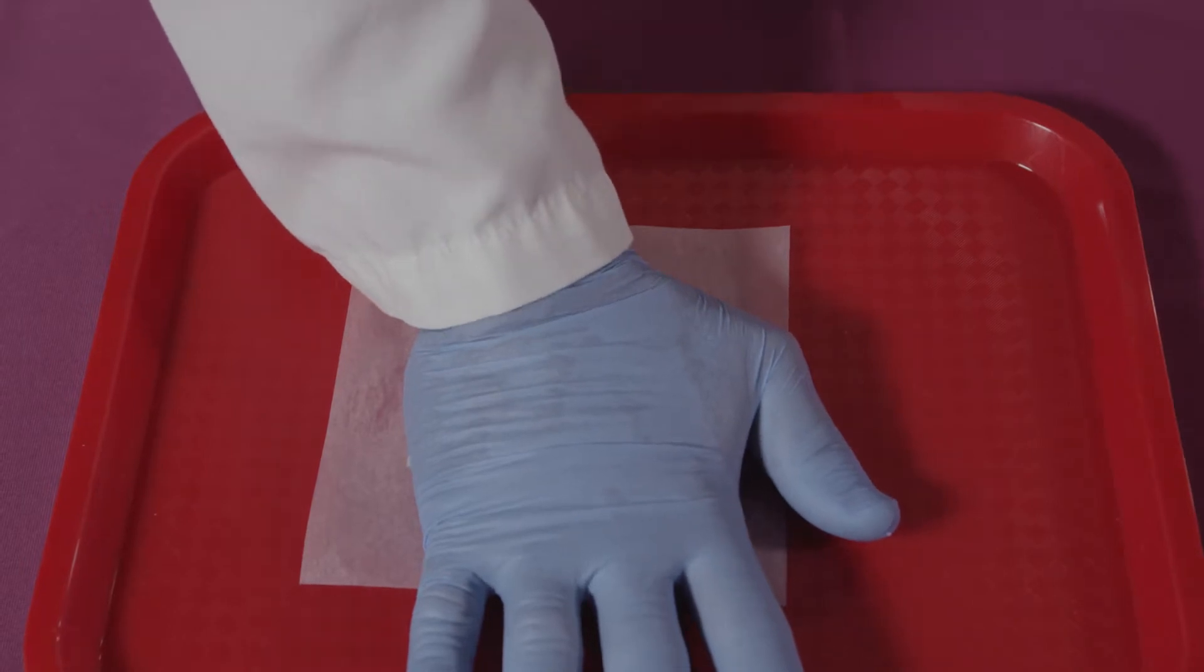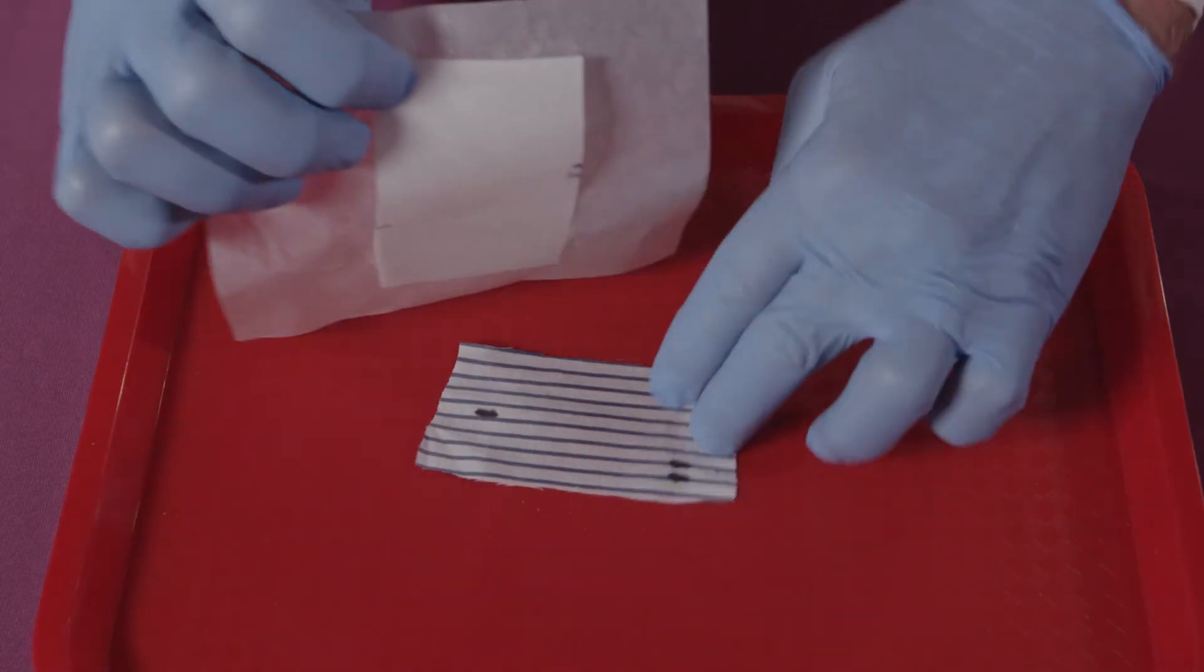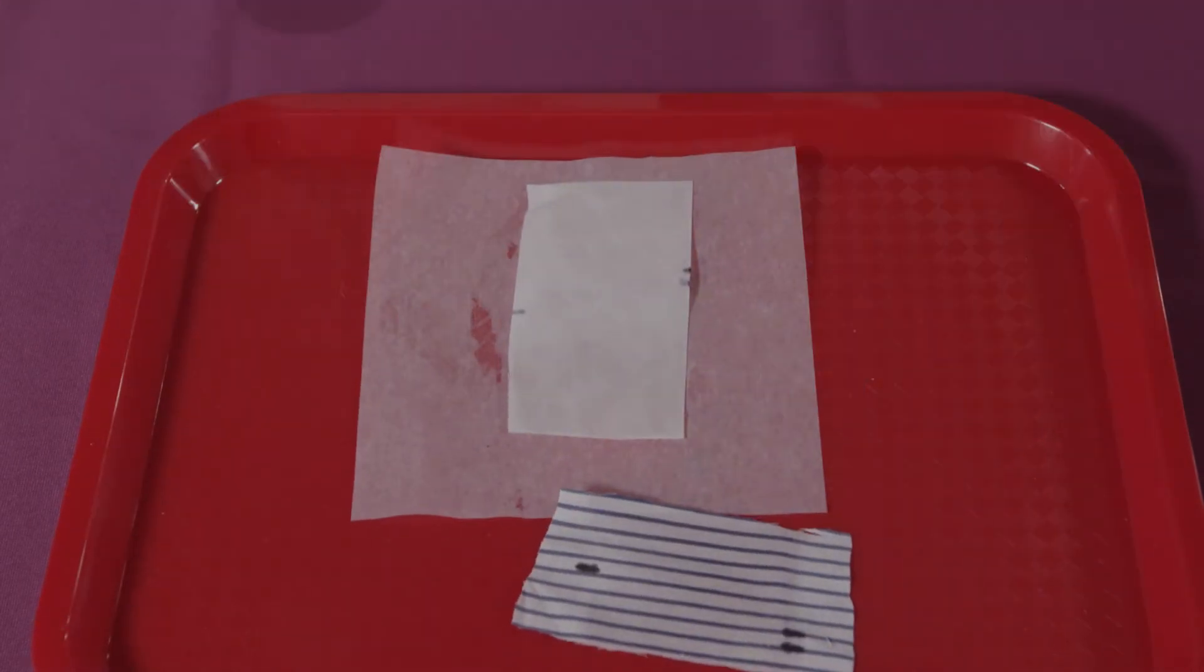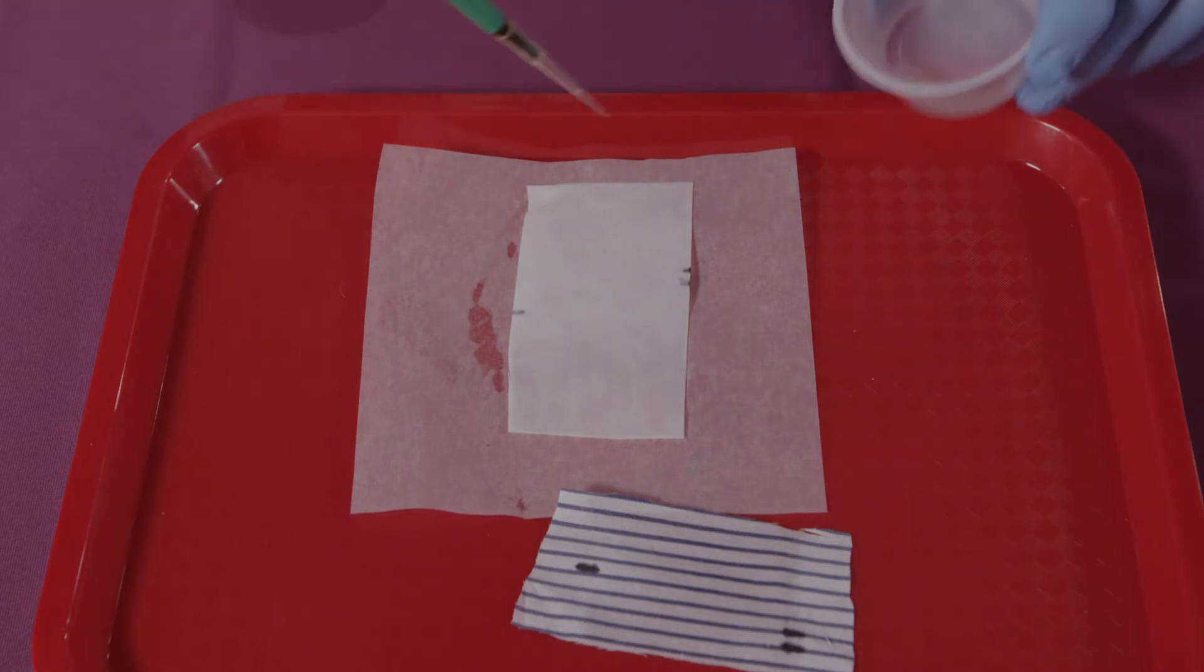The amylase paper is then removed from the article. 20 microliters of a known diluted saliva standard is applied to an area of the paper that was not in contact with the article.